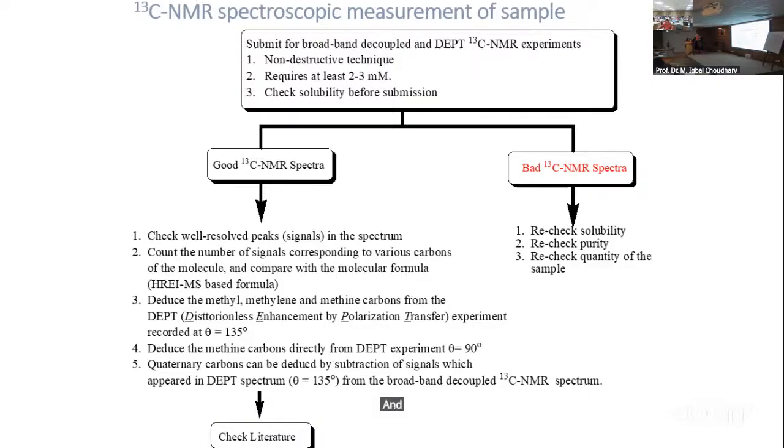And due to this overlap, this proton NMR spectrum has all the information you require, but you need to decipher it. So that is why 2D is required. While the C13 NMR spectrum has a bigger scale, like 0 to 220, so there is very, very little chance of signal overlap. And in the proton NMR spectrum, the advantage is you can integrate it.